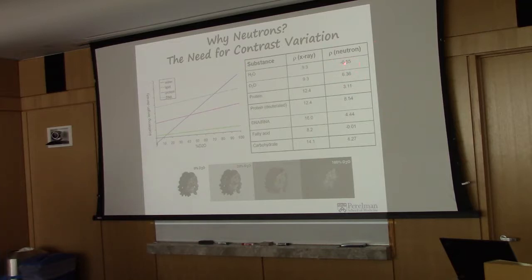In neutrons, you have concerns with both coherent and incoherent scattering. Incoherent scattering is sort of background scattering. It's not much of an issue with synchrotron X-rays, but with neutrons this is a big deal. So what we do in neutron scattering is optimize our signal using deuterated components, whether deuterated water in the solvent, deuterated protein, deuterated lipid, or something else that's deuterated. We leverage that to get specific scattering power from that species as it exists as part of the larger whole.